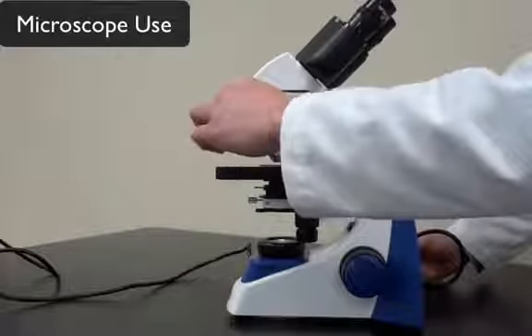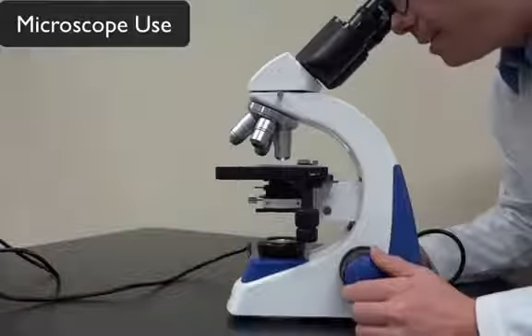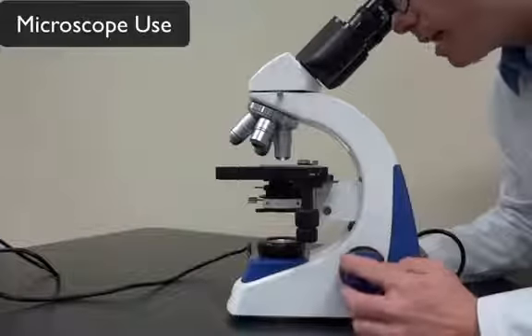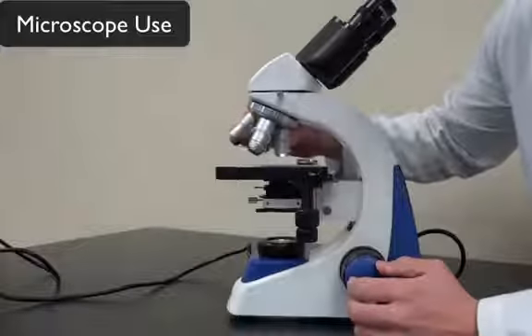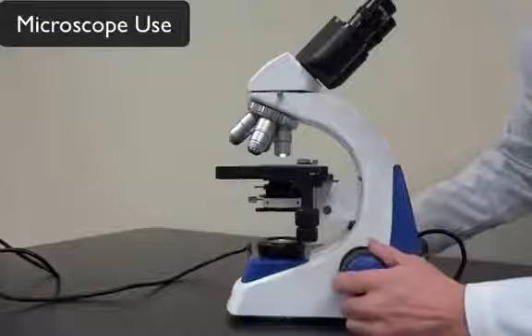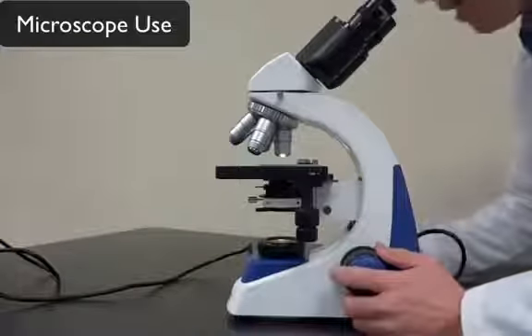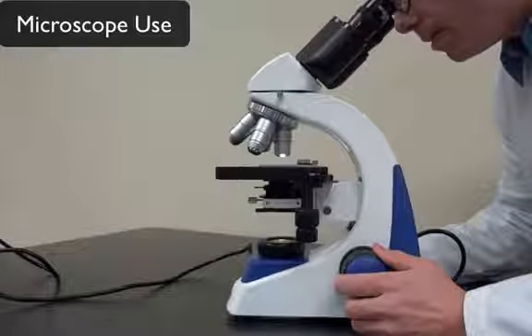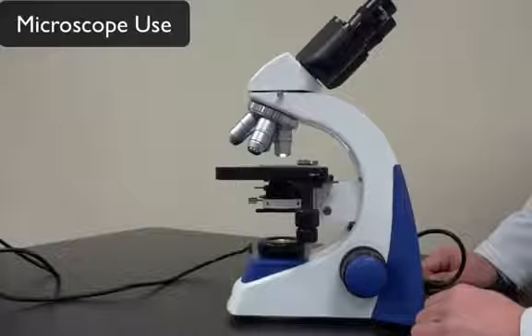What I need to do is drop down to the next lowest power, in this case the low power, and see if I can get it in focus there using the fine adjustment. If I can't, I have to go all the way back to the scanning power and see if I can get it in focus there. I may even have to start all over, raising the slide stage all the way up and then lowering it down until it comes into focus, and starting over with the process again.